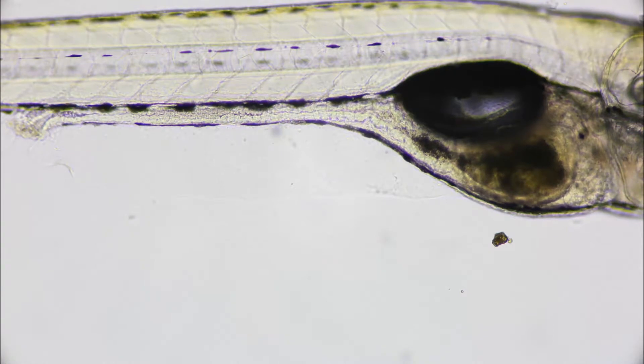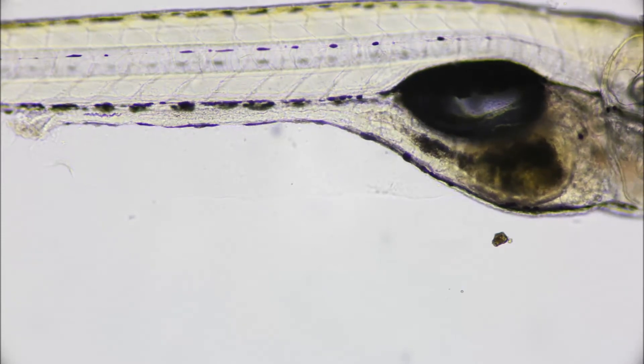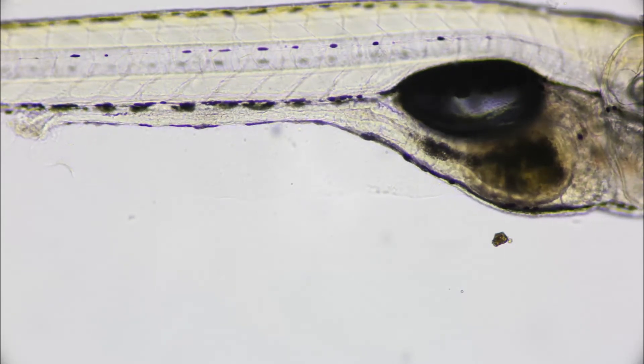My name is David James and I am a PhD candidate in Dr. Dahlman's lab. I use zebrafish to study a model of Phelan-McDermid syndrome, which is a genetic form of autism. We use these fish because they are highly transparent when they're young and they're amenable to genomic editing techniques such as CRISPR-Cas9. We use them to study a GI-associated disorder linked with Phelan-McDermid syndrome.